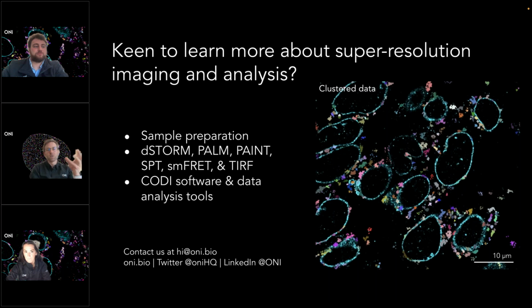So you can understand your data by changing the color of the localization. For example, in the example that I had earlier in the presentation, you were expecting to see a kind of ring-like structure. If you're only expecting to have some on the outside, but you see some localizations on the inside, it's probably from those kind of double localizations, and you can use those tools that I just mentioned to visualize maybe the photon count or the size, and then set your filters to filter those out specifically.